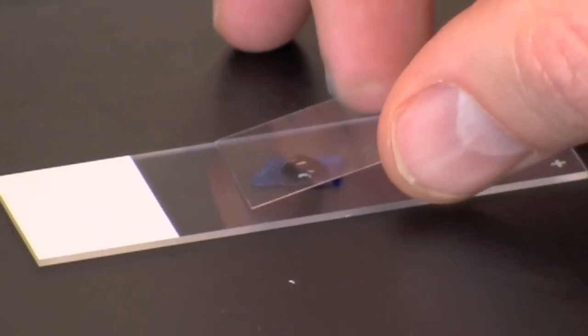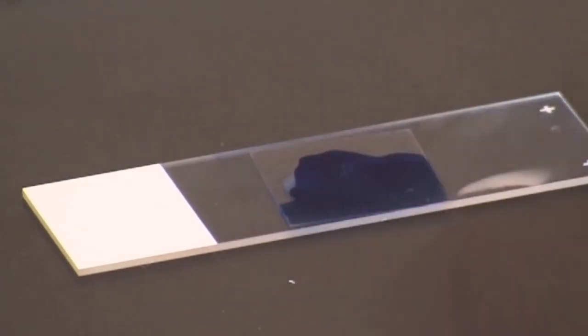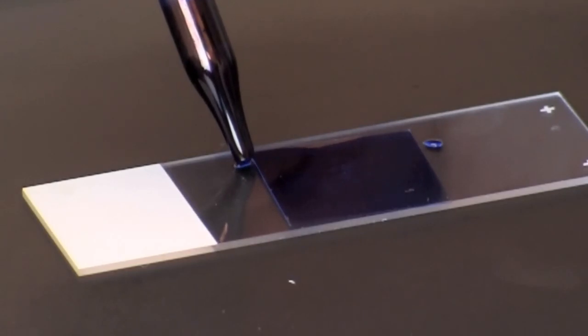Prepare the wet mount by lowering a cover slip over the stain, starting at a 45-degree angle. If a bubble forms under the slide, additional stain may be added along the side of the cover slip.